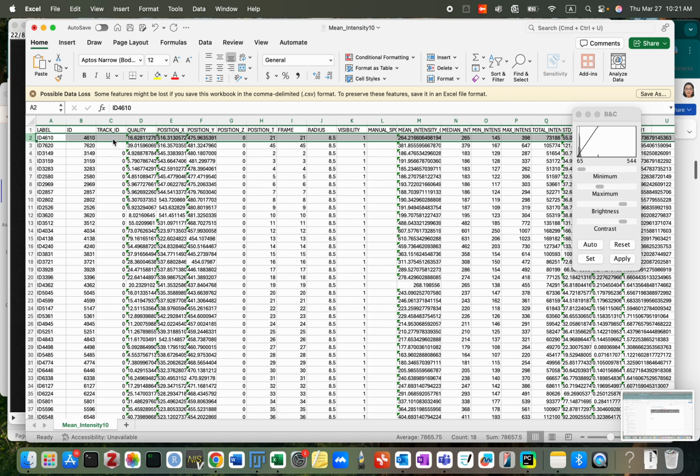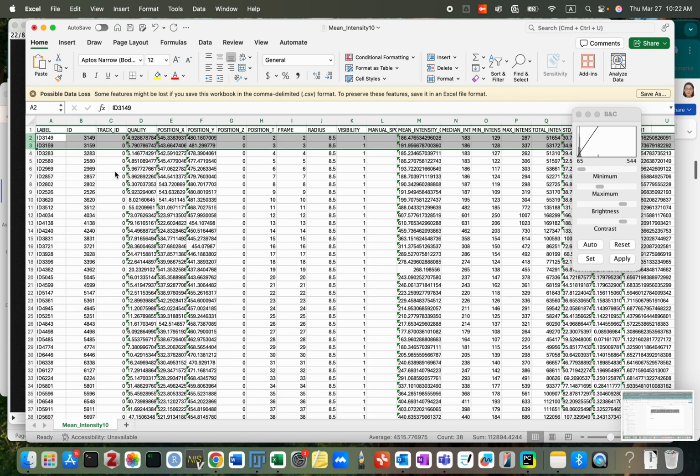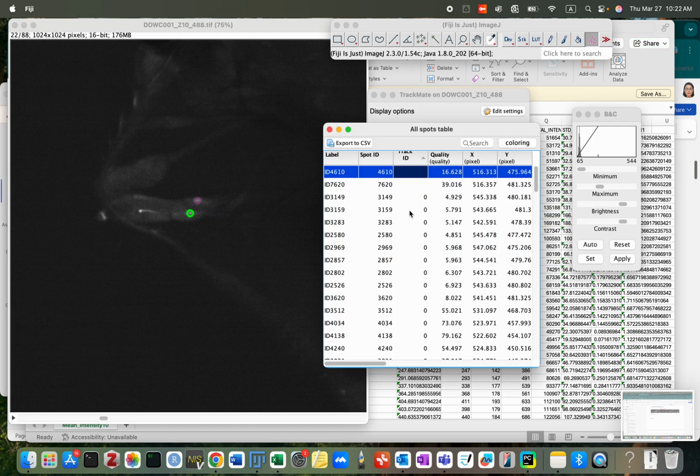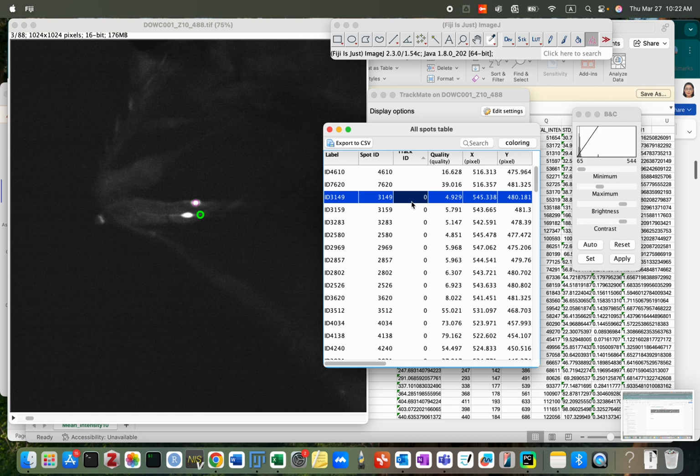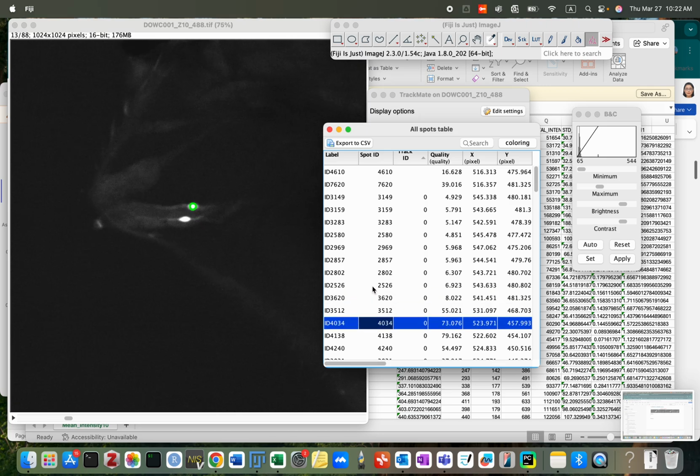Checking ID, there we have 2 datas, no checking ID, that's neuron 1, and then let's delete them. Delete. Okay, now come to see all the tracking ID, which is 0 from here, and see this green circle shows what those selections are.